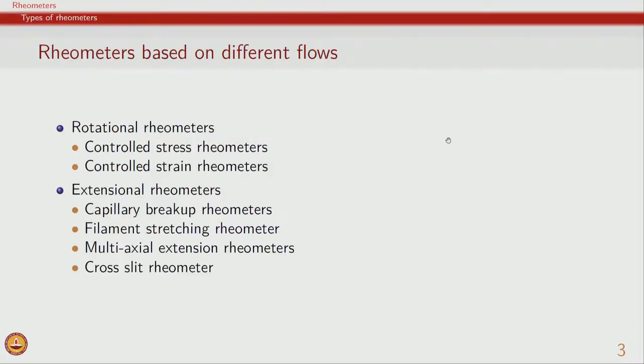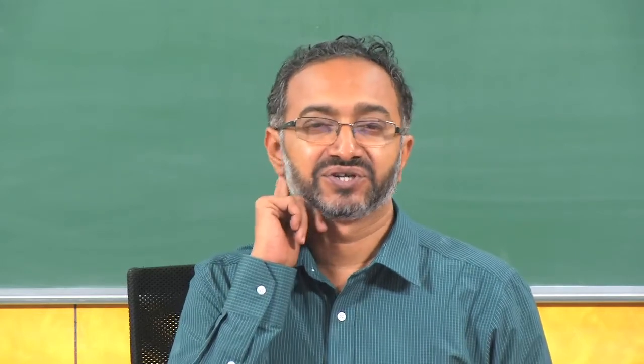So, this is as far as the overall set of rheometers which are very useful and which are broadly used. Control stress is the most commonly used, control strain many times, and of late extensional rheometers are also being used for various applications. And so, the next is whether we can do something more with the rheometers, and so that is why I have just called it rheometer plus. So, can we add on some features and then try to do measurements along with rheology.